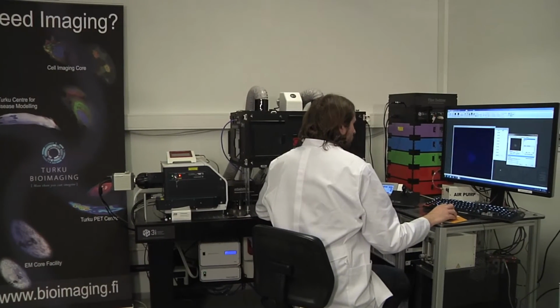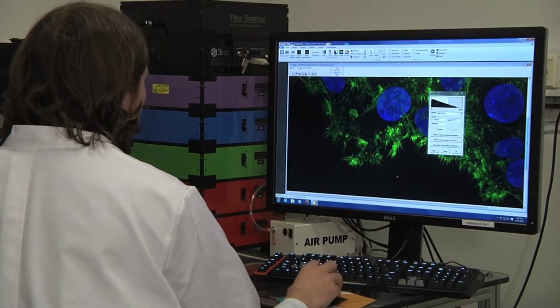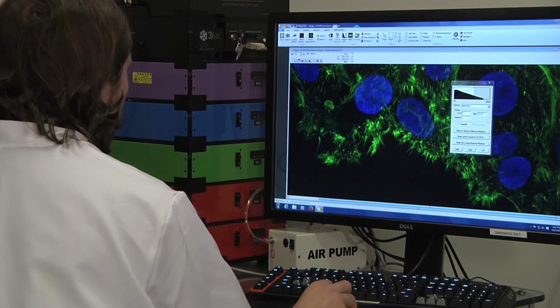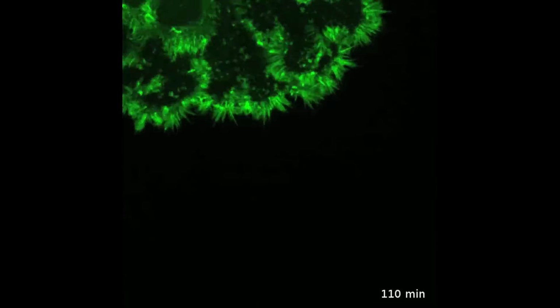This scanning principle makes new things possible for researchers. So now we can image samples live, so live cells, through thick samples or relatively thick samples at high speed that we were not able to do before. So before, if we wanted to do live cell imaging, for example, in 3D microenvironments, then using the normal confocal, we would not be able to do long time lapse because we would kill the cells quite rapidly.